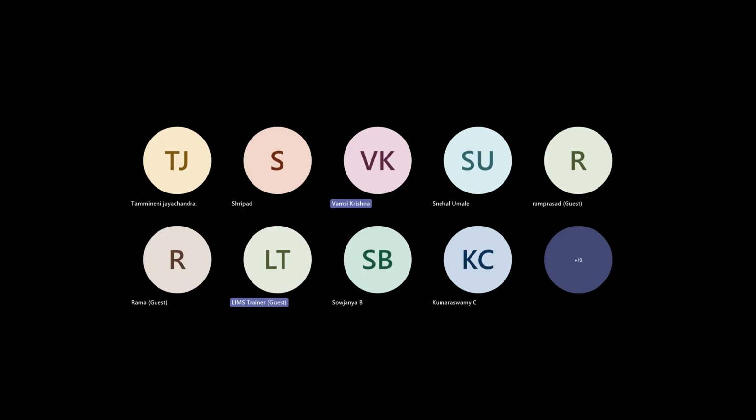That's what I'm telling you. Even if you go for a tester role, obviously it will help. 100%, 10,000% it will help. Because even if you test, you need to go into the LIMS. Inside the LIMS, you need to create a sample, log a sample, and do testing by entering the values. So you should know why this is happening, why that is happening, why at the back end this is happening.